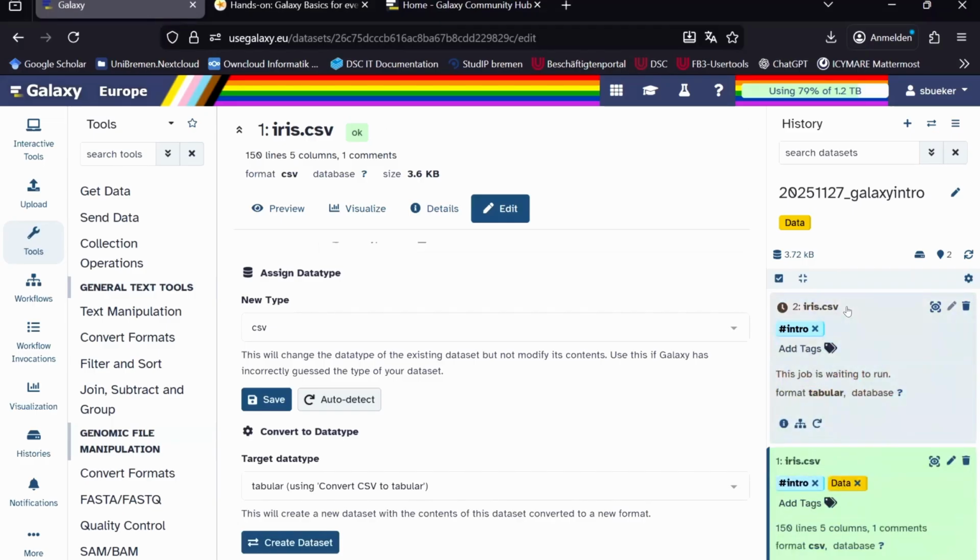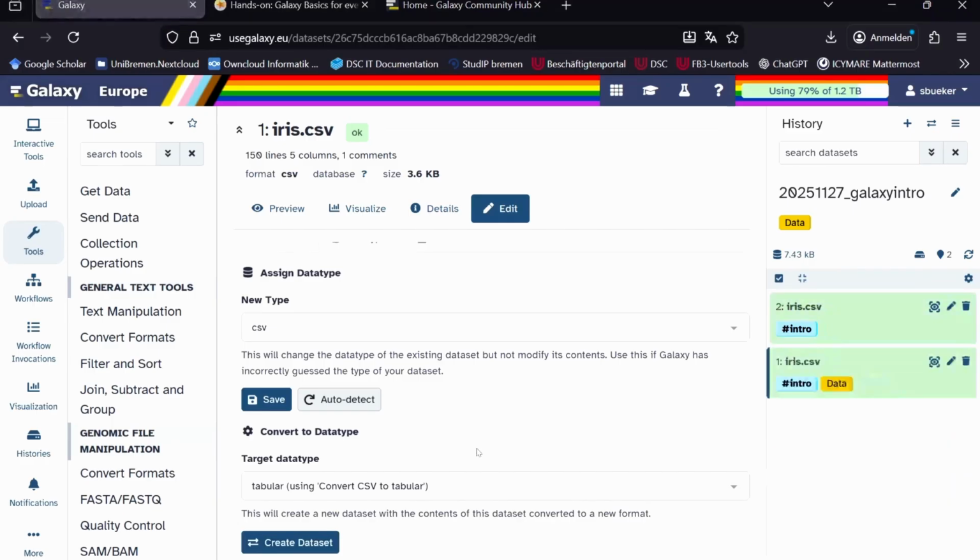It now has produced a new data set. The header has changed. If we don't use a hashtag for our tags, it will not migrate. But if we put a hashtag before that, it will migrate. For example, if we have an analysis about a microbiome of mice and we have some mice DNA and some of the bacteria, we can see later on if our data sets are from the mice or from the bacteria.